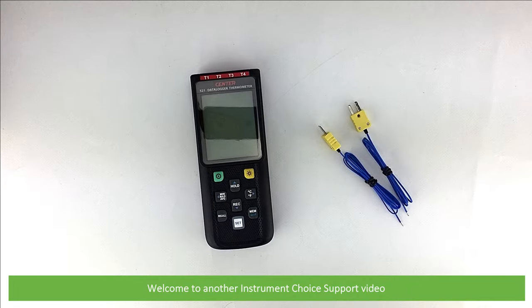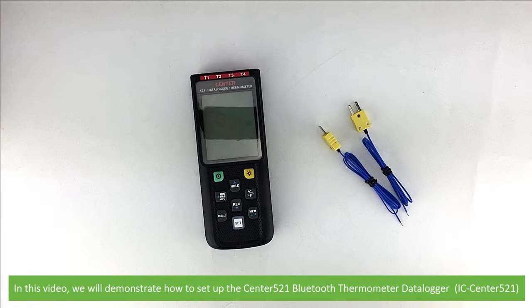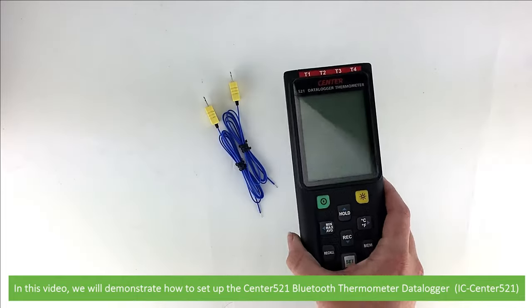Hi and welcome to another Instrument Choice support video. In this video, we'll demonstrate how to set up the Center 521 Bluetooth Thermometer Data Logger.